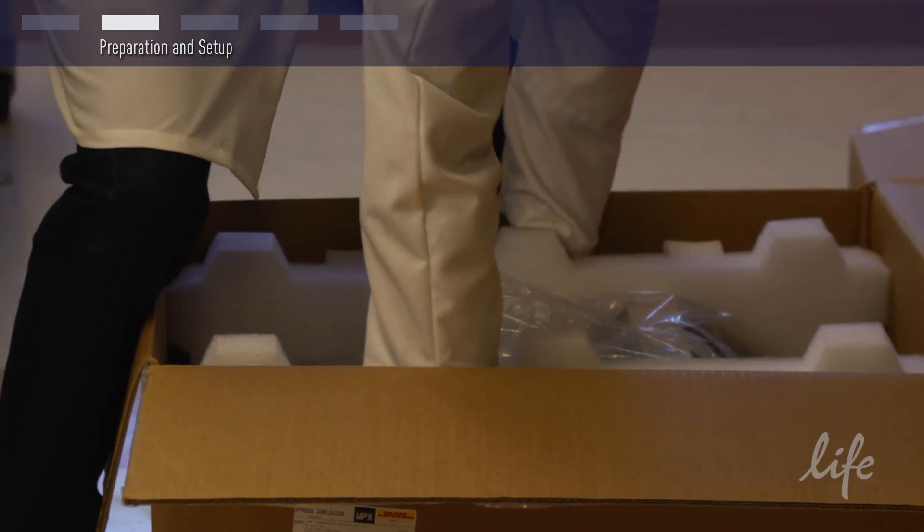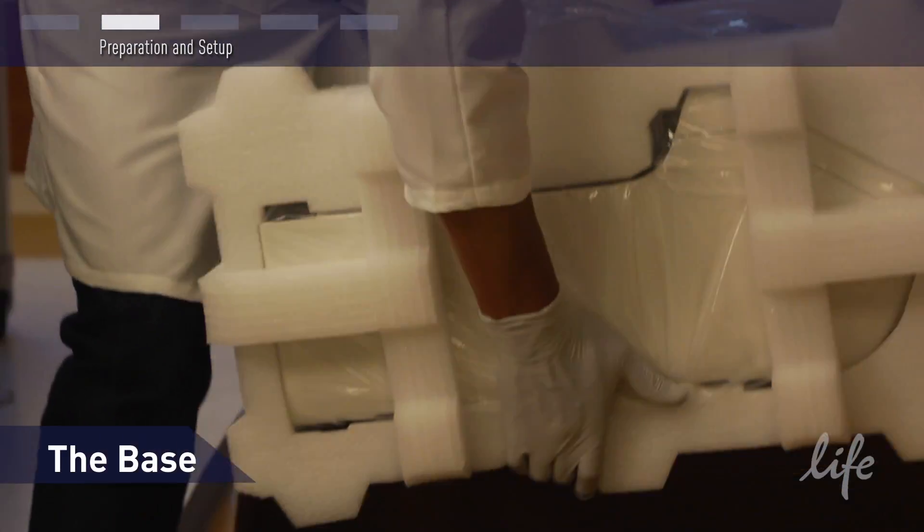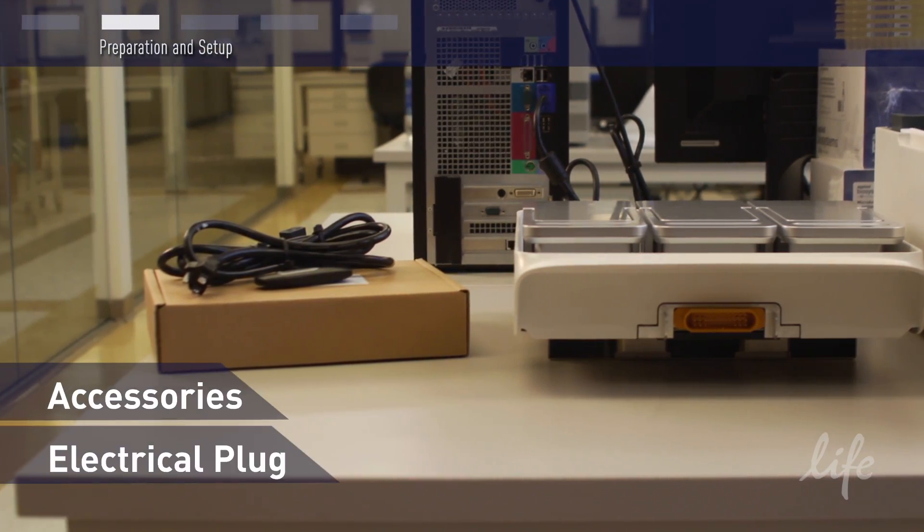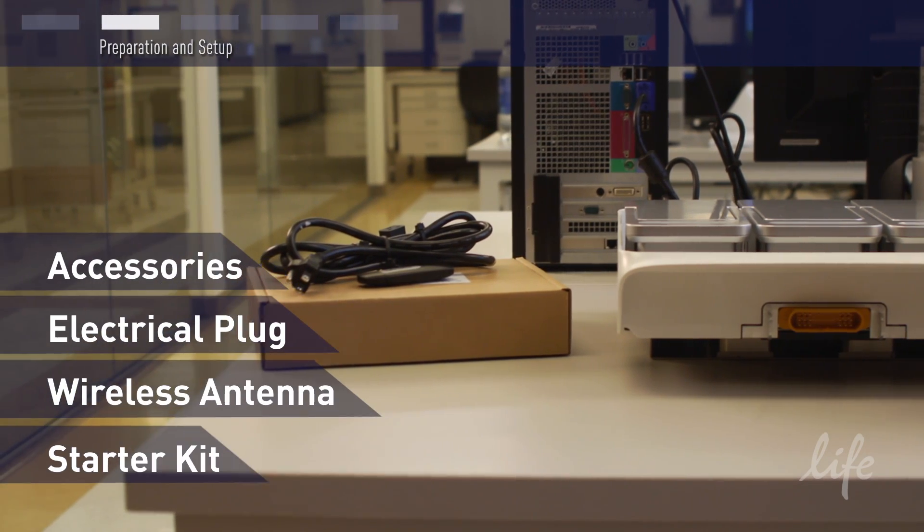The ProFlex will arrive in a package of three boxes. One contains the base, one contains the thermal block, and the final box contains the accessories, including the electrical plug, wireless antenna, and starter kit.